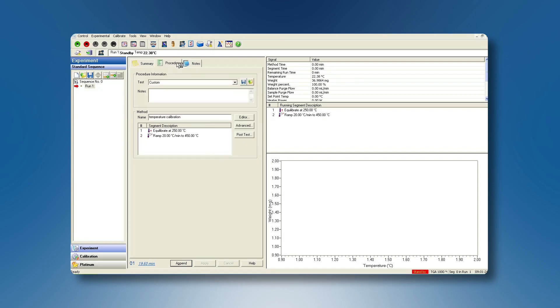In the Procedure tab, create a method to equilibrate the furnace to about 100 degrees below the literature Curie temperature of the material. Heat the material at the same heating rate that you will be using in your subsequent experiments to a temperature about 100 degrees above its Curie temperature.